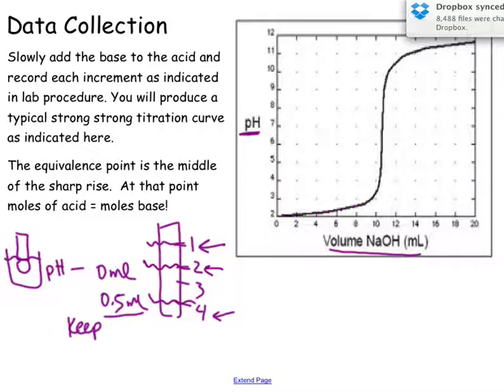That's going to create this really cool graph. I'll be walking around. You want to collect a lot of data points. The more data points you collect, the better off you'll be. That's why you have an entire hour to collect these data points, an entire period. So we get really ugly curves if we only have 4 or 5 points.